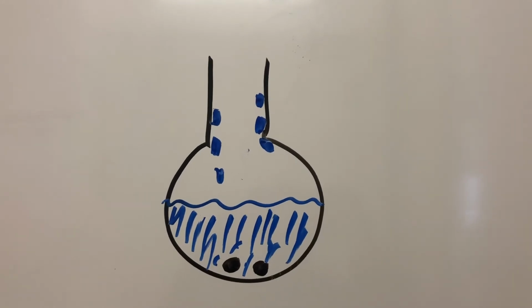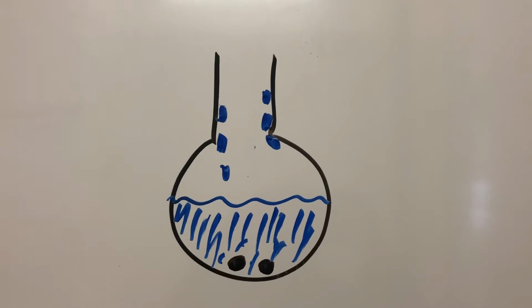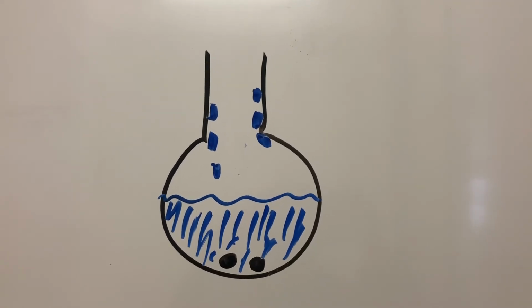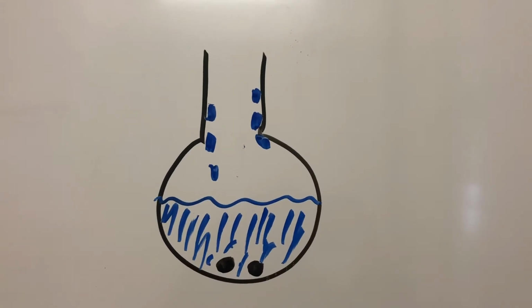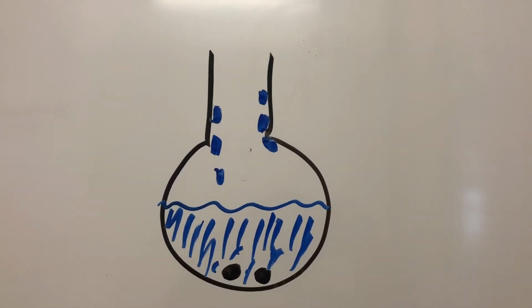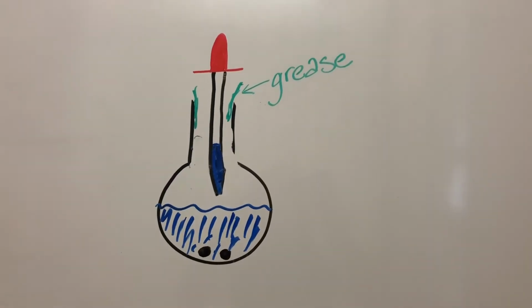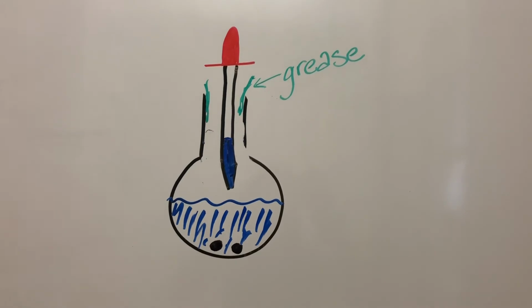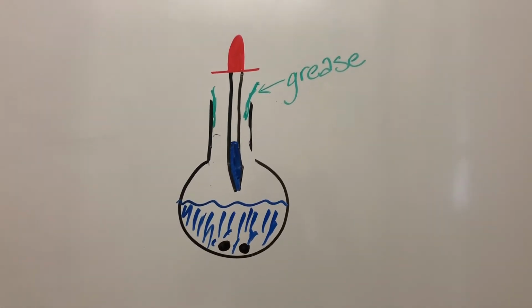After the reactants have been placed in the vessel and the Bunsen burner has been lit, carefully examine the reaction. The time for the refluxing period begins after noticing the first few droplets of liquid entering back into the round bottom flask. Once the reaction has refluxed for 15 minutes, let the reaction cool to room temperature by removing the ceramic pad.